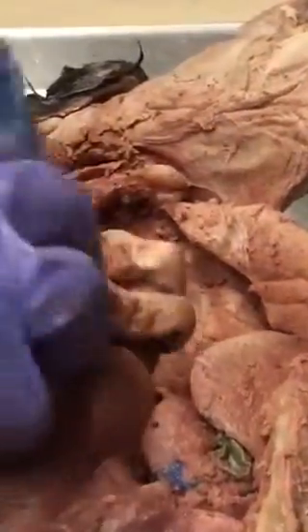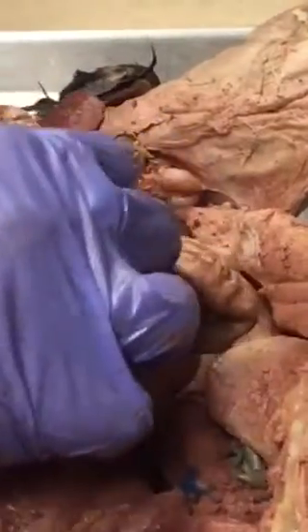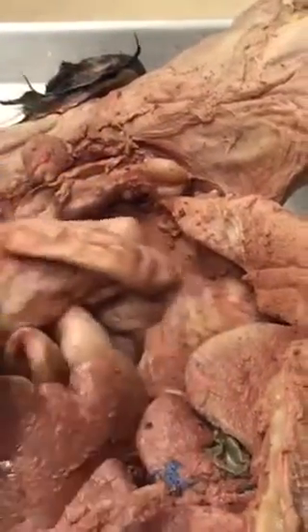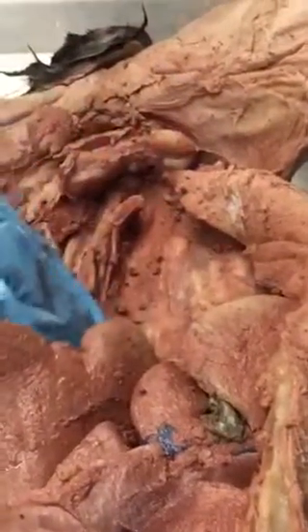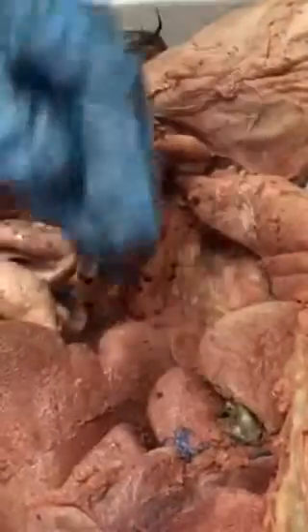So we want to find the kidney. The kidneys are retroperitoneal, which means they're covered by the parietal peritoneum, but it's covering the anterior surface of them. They're kind of on the back of the body. Like a kidney punch, when somebody punches somebody in the lower back, that's because the kidneys are back here rather than more towards the front.